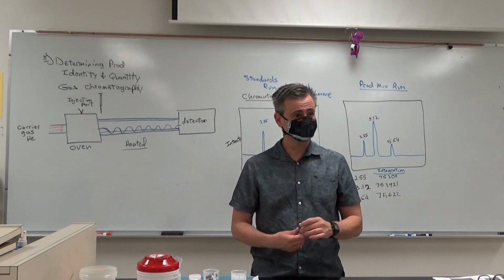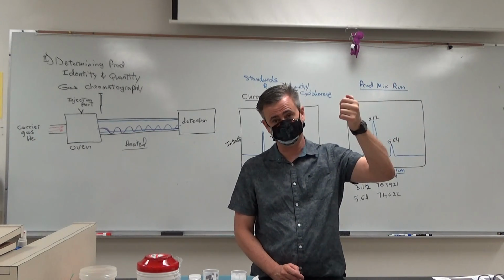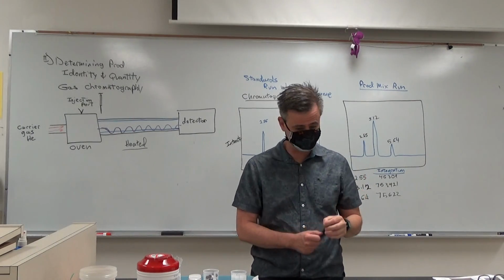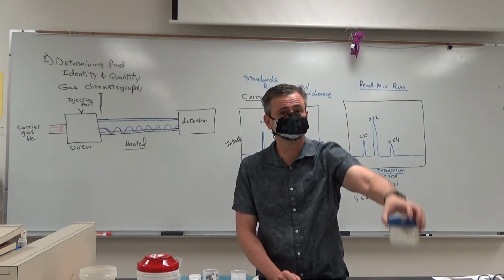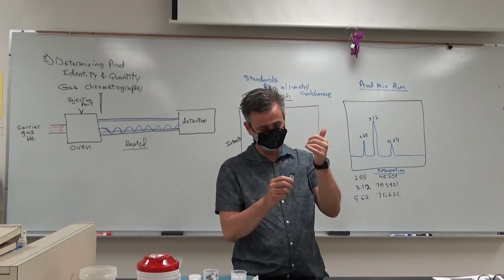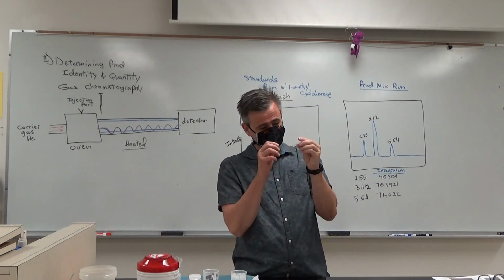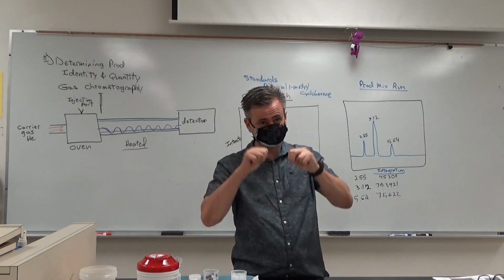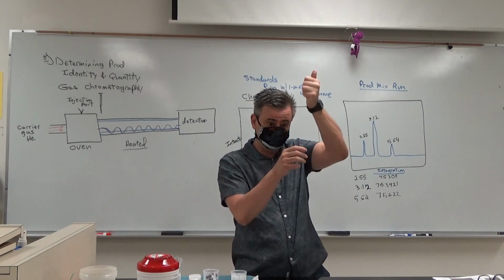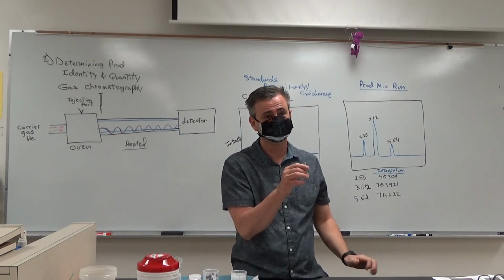You're then going to use the fancy auto pipetters and take 10 microliters of your product mixture, which is where you left it in the refrigerator. You're going to put the tip of it under the surface of the acetone and squirt it in.